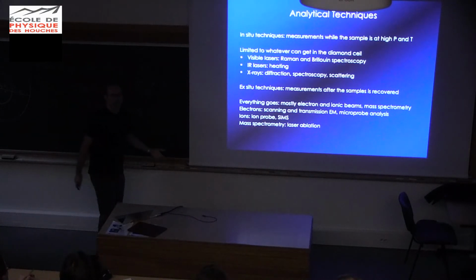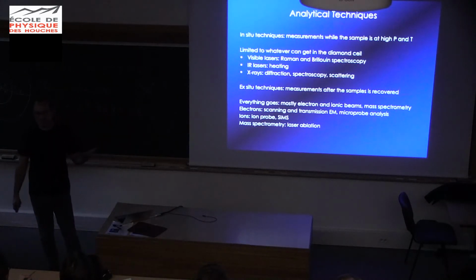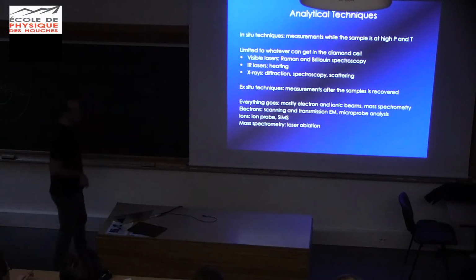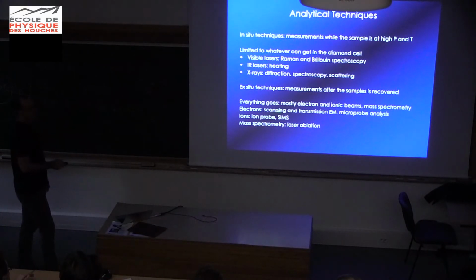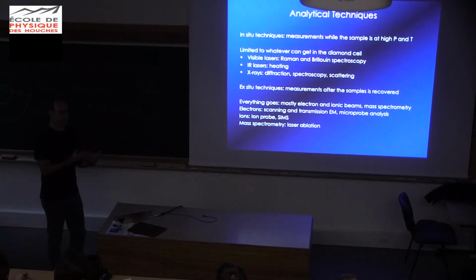And you say, okay, if I can do these measurements in situ, why do I even want to bother doing anything else ex situ? I mean, isn't in situ better? It is better, but there are things that you cannot do in situ. And this is why you use a lot of ex situ techniques as well. The reason is everything goes. Once you recover your sample, it's sitting outside in your hand. It might be tiny, but you can probe it with anything. You don't have diamonds or tungsten carbide cubes sitting in your way, right?